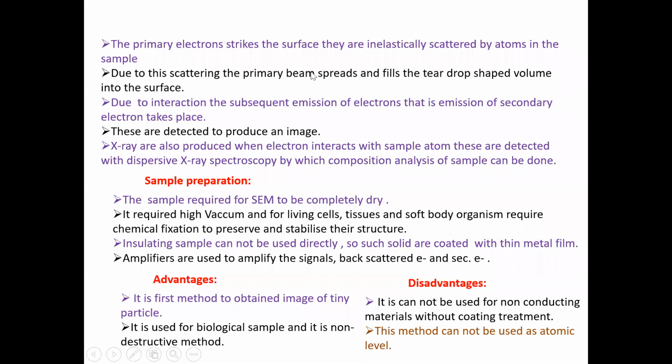The very important thing is how the sample is prepared for characterization with this instrument.